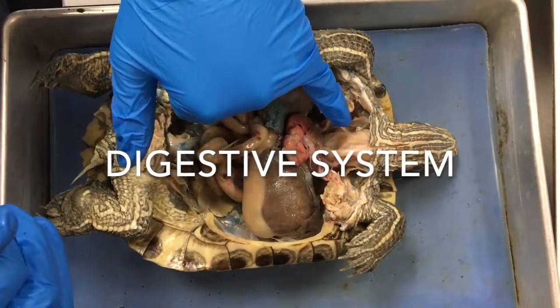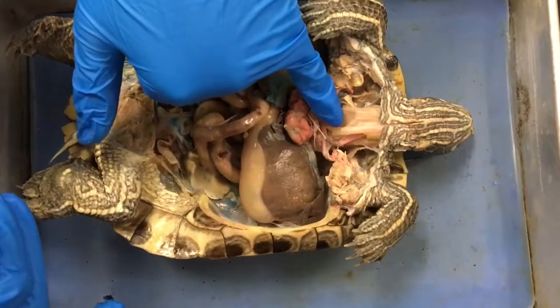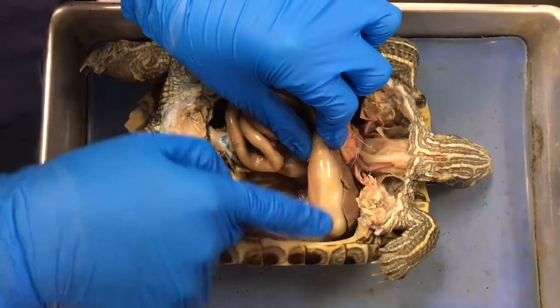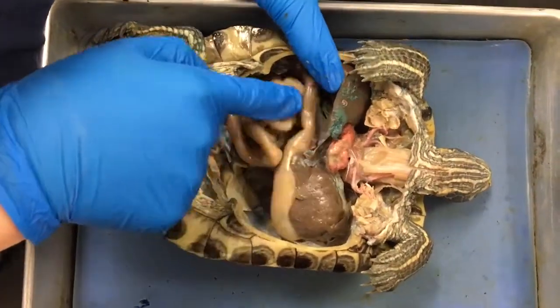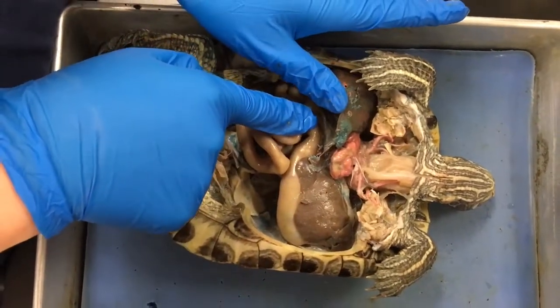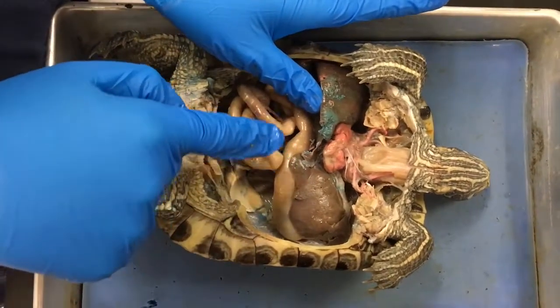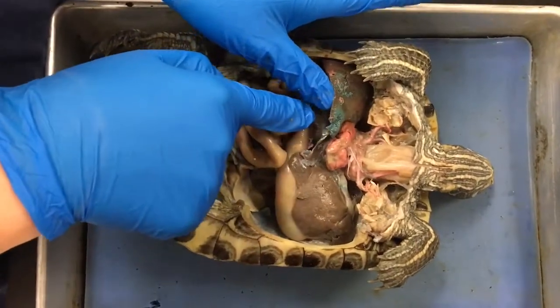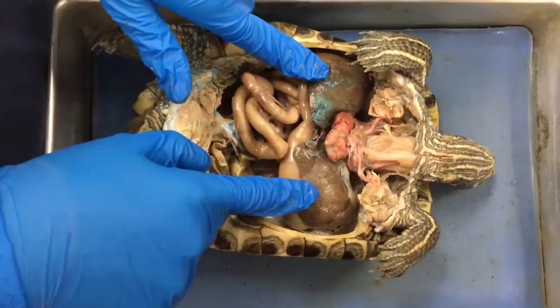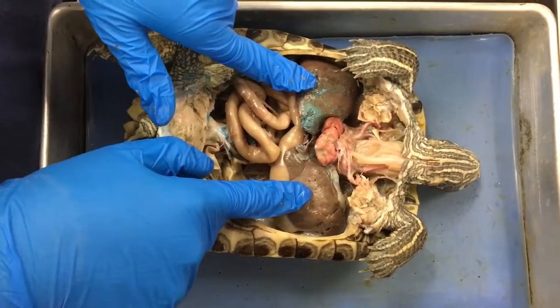The esophagus delivers food to the stomach from the mouth; it is smooth and muscular and dorsal to the trachea. The stomach secretes acidic juices to break down food. The pancreas is up under the liver and is the major gland of the digestive system; in turtles it has an appearance similar to the mammalian spleen, and it secretes digestive juices made of water, electrolytes, and enzymes into the small intestine. The liver metabolizes carbohydrates and fats, and serves in bile pigment production and cholesterol metabolism.